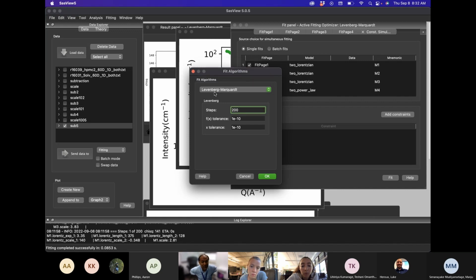Dream is far more time consuming. So you would want to apply something first to get your fits close, so your fit is on the curves, it's not somewhere else. Then if you apply Dream, it'll not take as long as if you apply Dream directly. Okay, thank you.